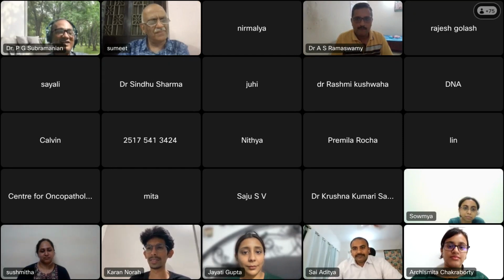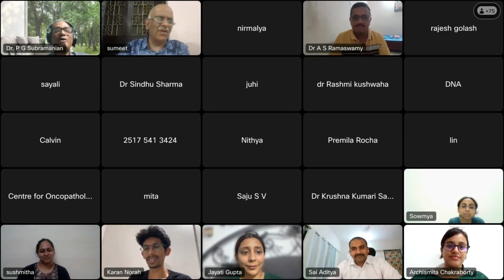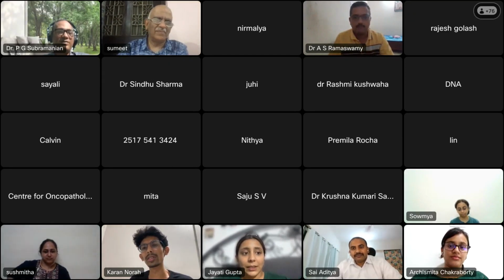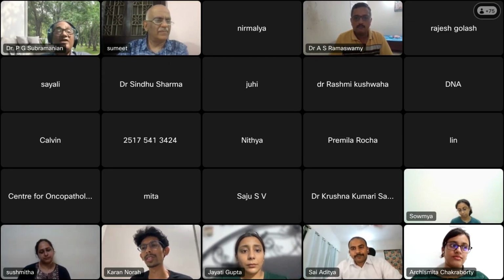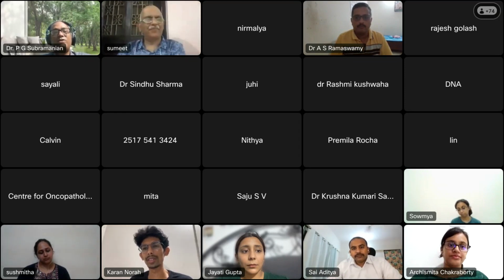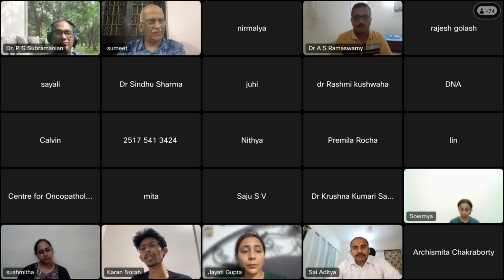Whatever I recommend, there will be somebody who will say with genuine reason that this is not correct. So I would rather say, if you're going for a minimum, I would prefer at least 6. Doing it with less than 6 is very difficult. Minimum 6, preferably at least 8 to 10 colors I would want, if you are doing it only for diagnostic purposes. If you are doing it for monitoring purposes, then I would ask for 12 or 13 color. I would also want to know the aim of the lab. 12 or 13 color as of today at a minimum.